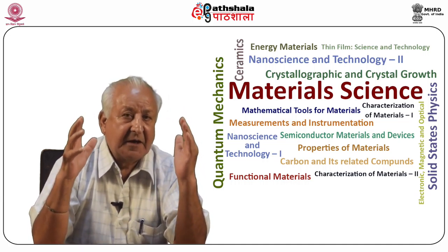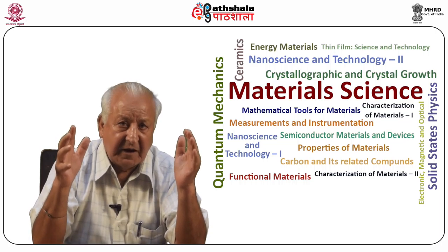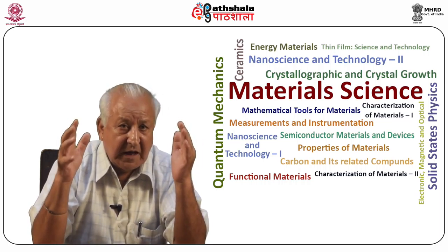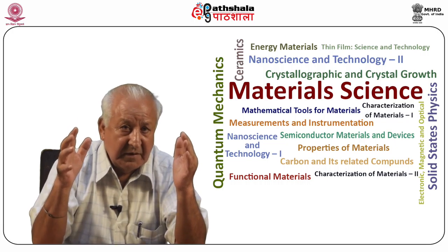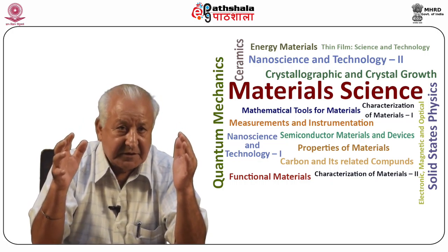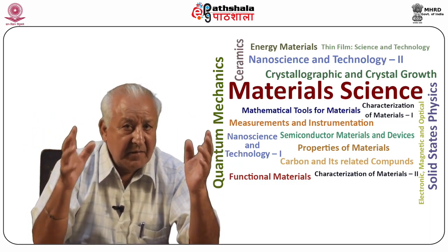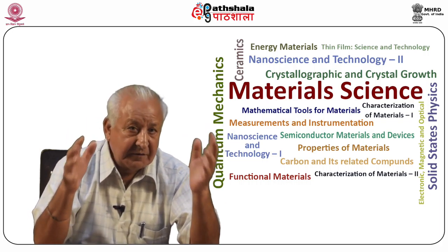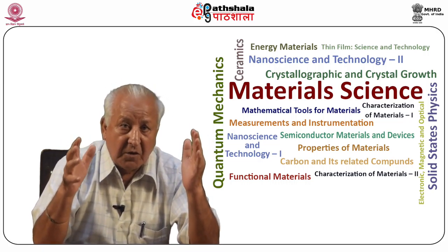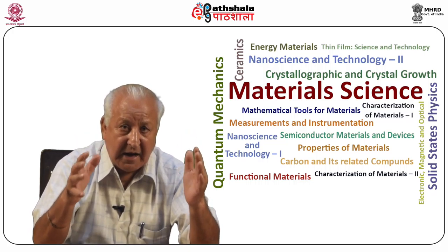However, there is a difference between X-rays and electron diffraction. Electrons are associated with very short wavelength of nearly 0.037 angstroms. For 100 kV electrons, the electron beam can be focused and data from areas less than 1 micrometer diameter obtained. These advantages of using electrons as probing particles make electron diffraction a better tool for investigation on small crystals than are X-rays.